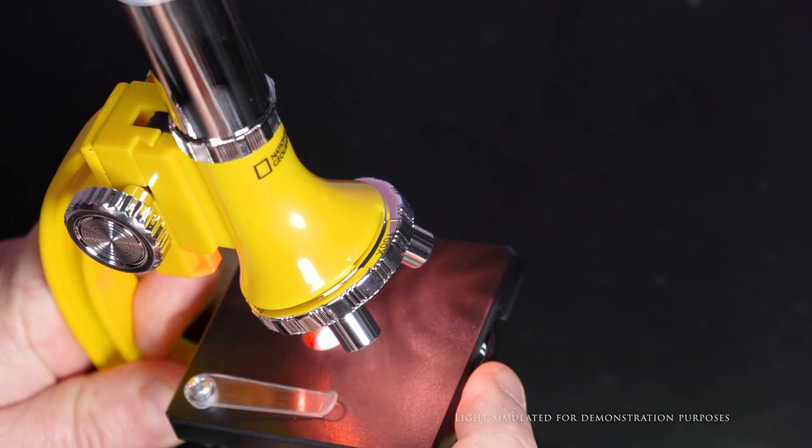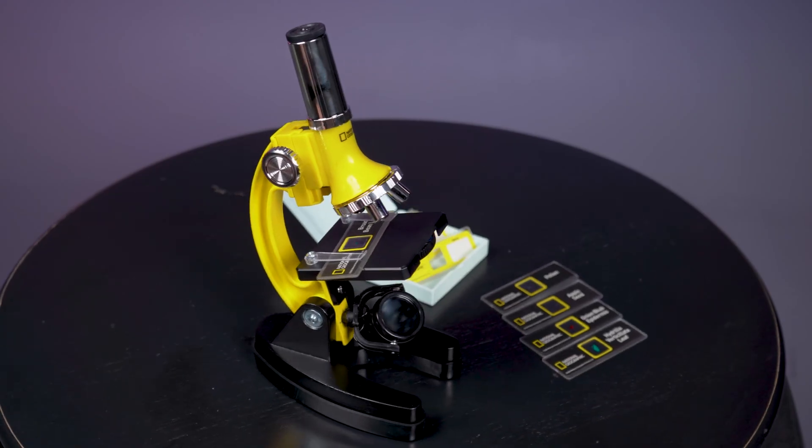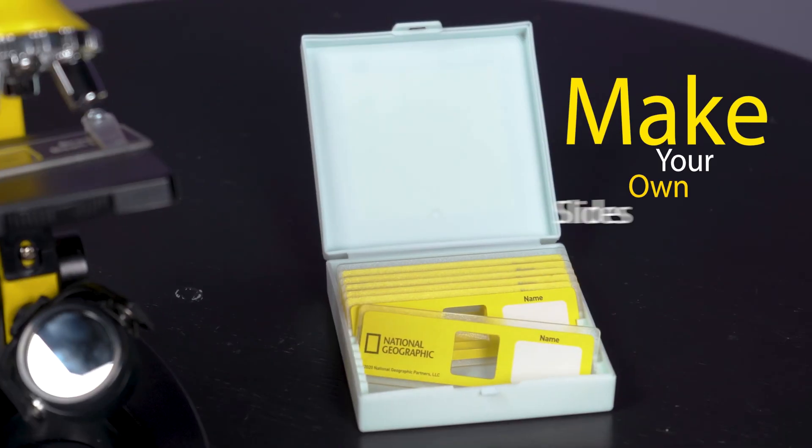And with its color filter wheel, identifying details of colorless or transparent specimens has never been easier. Ready to use out of the box with prepared slides, or create your own.